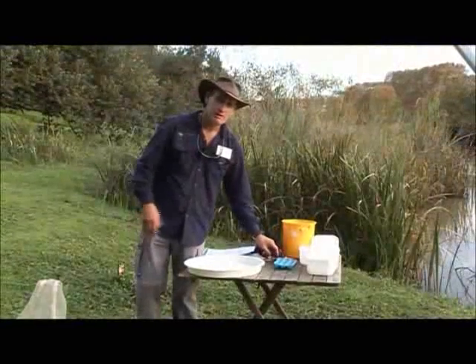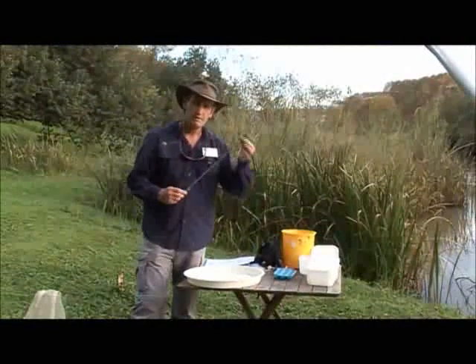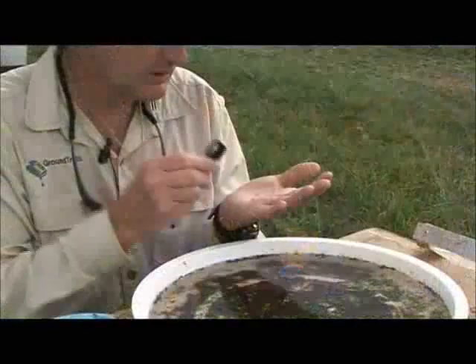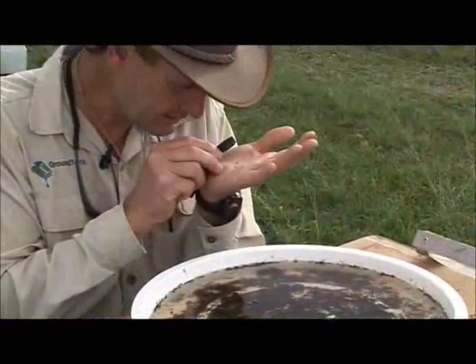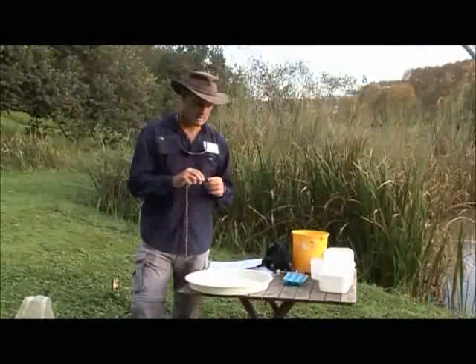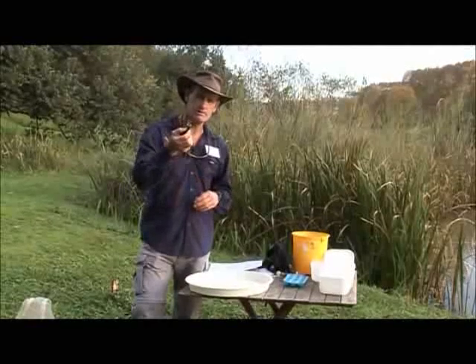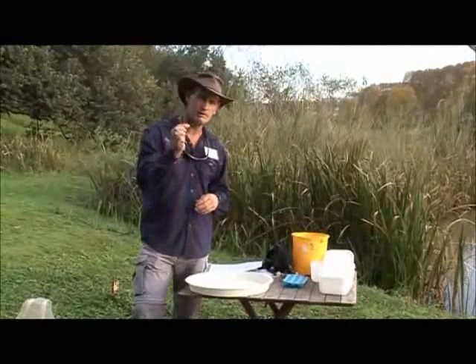Those are the critical things. Other bits and pieces which make the identification process useful: a jeweler's loupe or magnifying glass, just to help look at those facial features on things like the hydropsychids, the caddisflies, and other organisms in there. Very useful for looking at particular aspects which help with the identification.